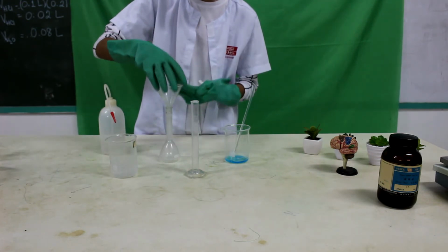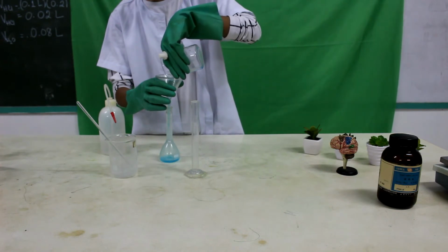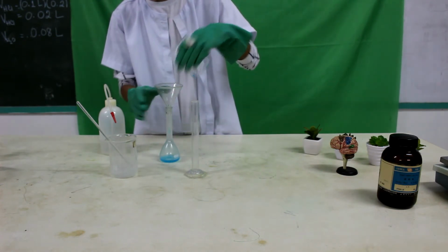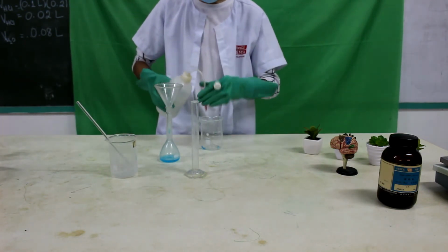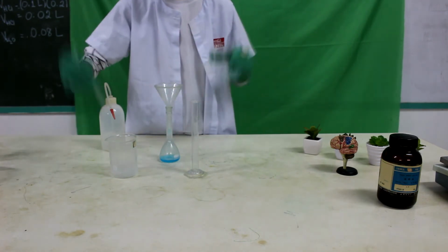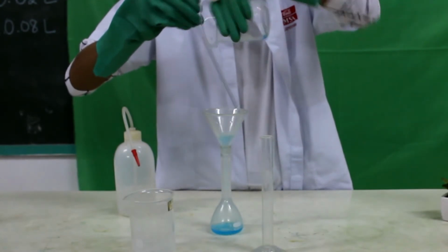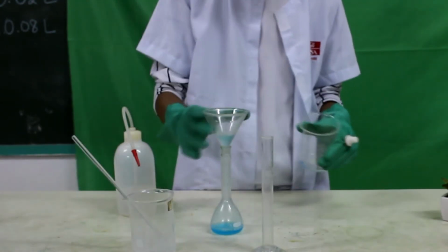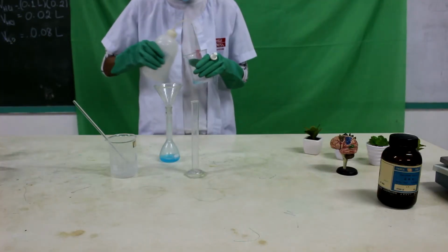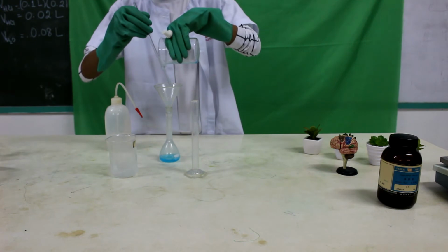Place the funnel on the volumetric flask and pour the copper 2 sulfate solution. You may use the stirring rod as a guide so the solution may not spill. Next is to fill the volumetric flask up to 100 ml.